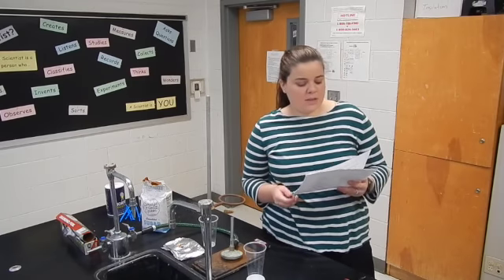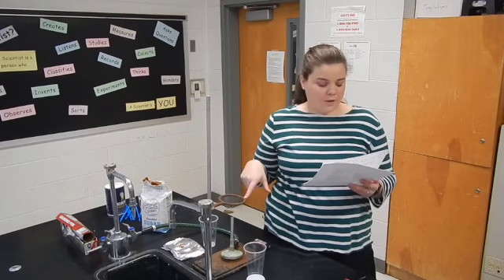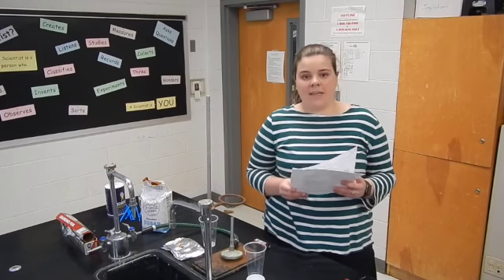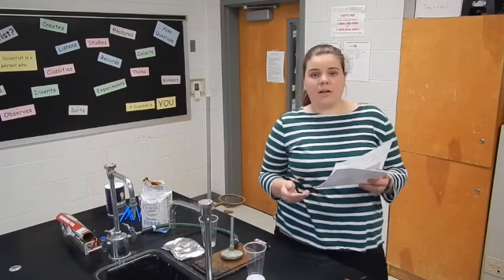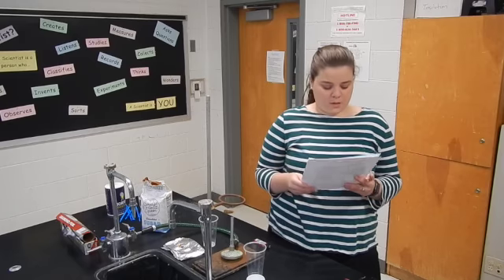The materials that we'll be using today are some aluminum foil, a ring stand, an iron ring, and a Bunsen burner. The chemicals we'll have are sodium chloride or salt, sugar, and then there are 4 unknown compounds.